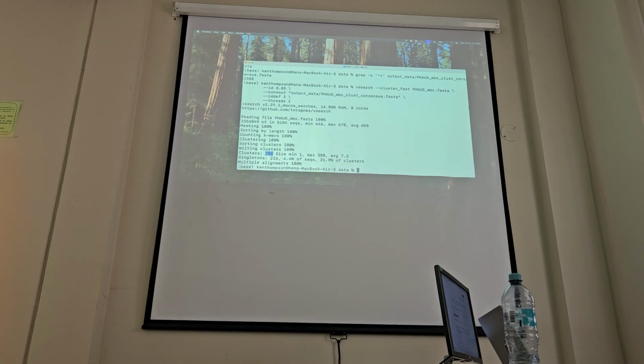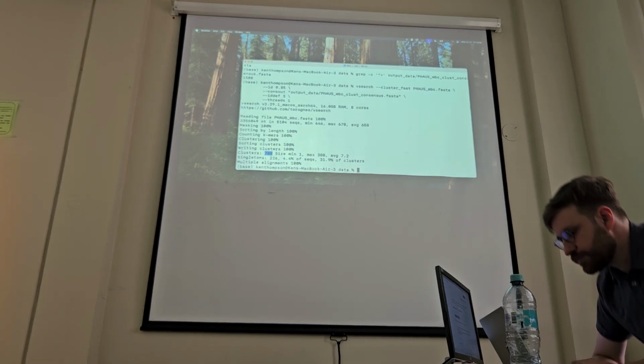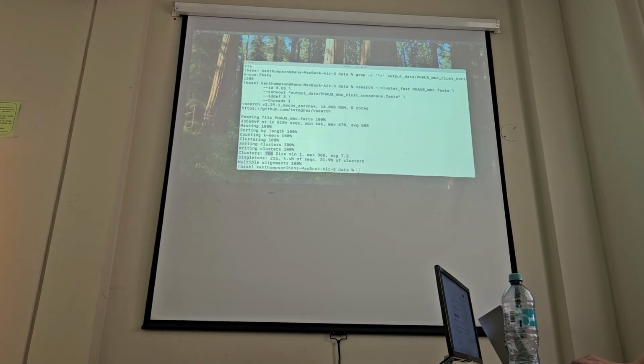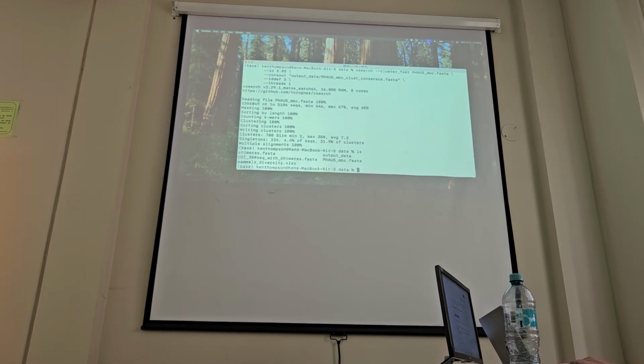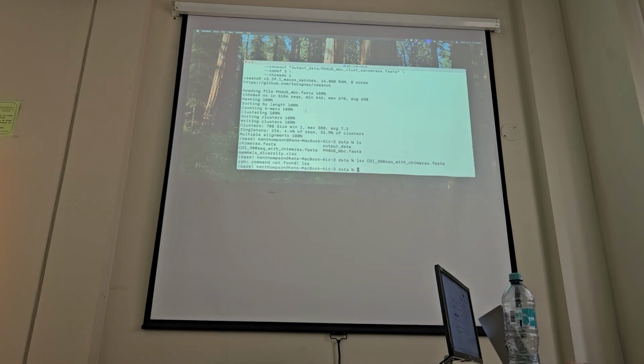Okay, so I'll just show then briefly Chimera screening as well. Okay, so we're going to look at this file. 300 sequences with some chimeras.